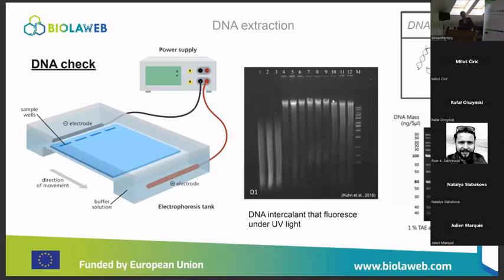So here in this study, they just put DNA that they just extracted in those wells, and you can have a profile like this. So we see that we have a high fragment of DNA on the top, and then you have what is called a smear, which is a gradient of different DNA lengths because you have different sizes of DNA.